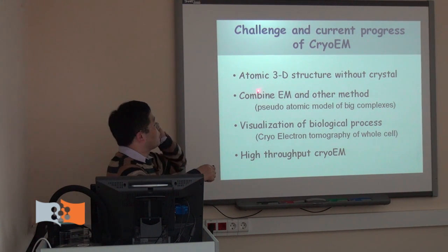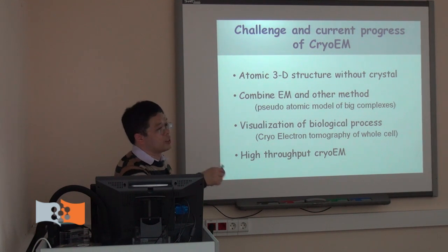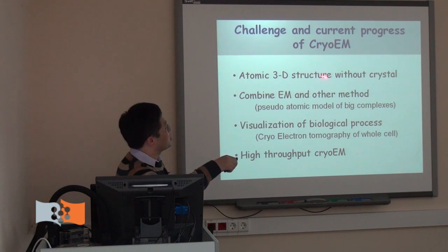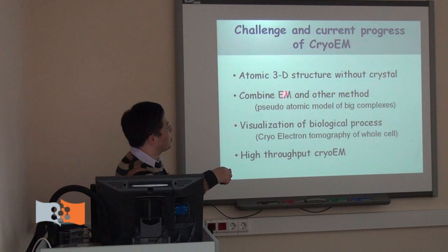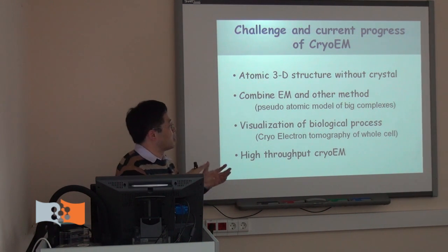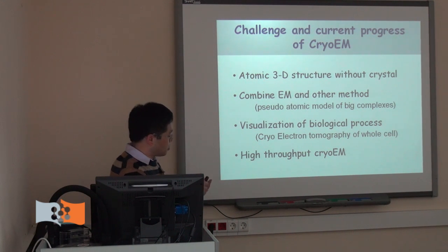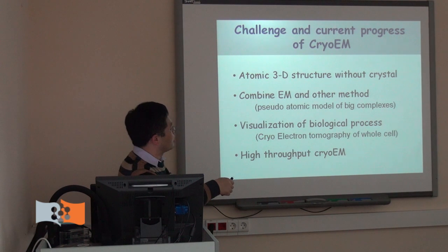We want to get the atomic structure without crystals, and we are getting more and more structures in this area. Also, we want to combine EM and other methods. For example, if we get a low resolution EM map, you want to combine it with the high resolution crystal structure to form the morphology of a big complex.